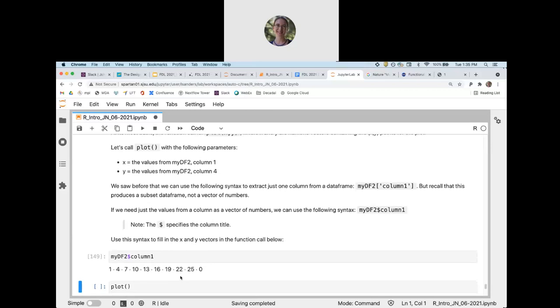Okay, so if the column had a space in the name, the $ would not work, right? We would have to use the bracket approach. Yes, so there is a workaround where if you had a space, and this works in some cases, perhaps in all cases, you can use these little quotation marks, which you can find on the same key on your keyboard as the tilde.